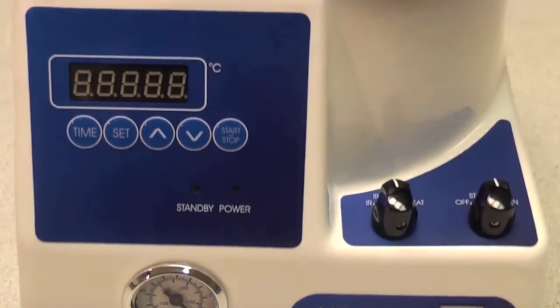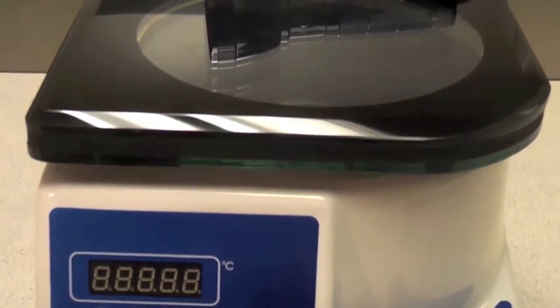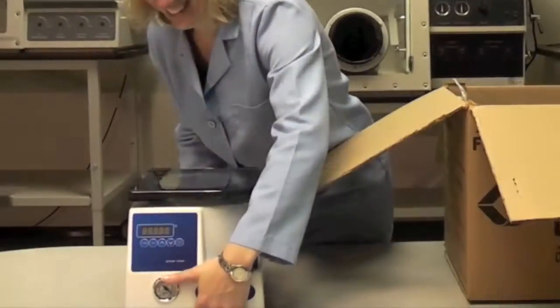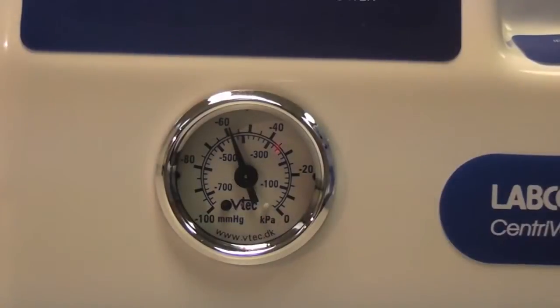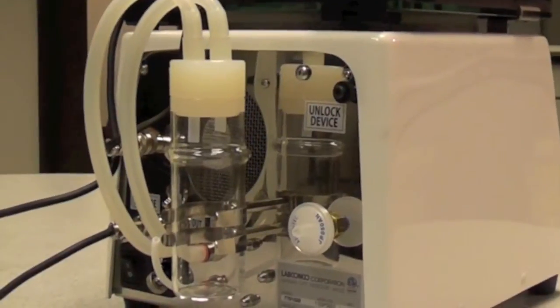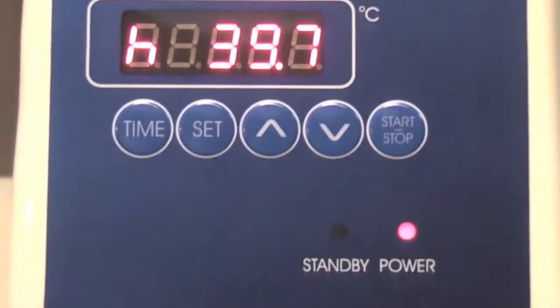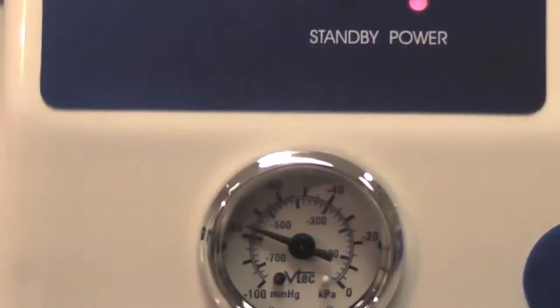The CentriVap Micro-IR includes everything you need in one handy package: concentrator, rotor, strobe light, vacuum pump, and glass trap, yet weighs less than 20 pounds. Just plug it in and you're ready to start evaporating.